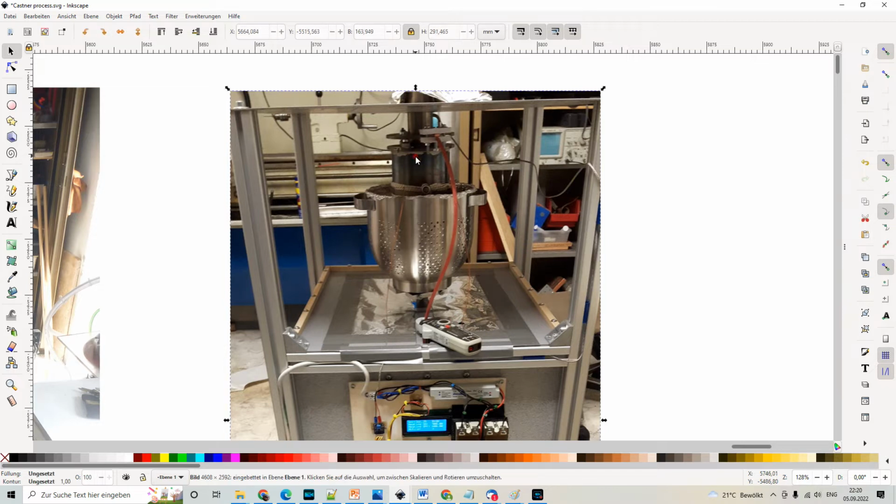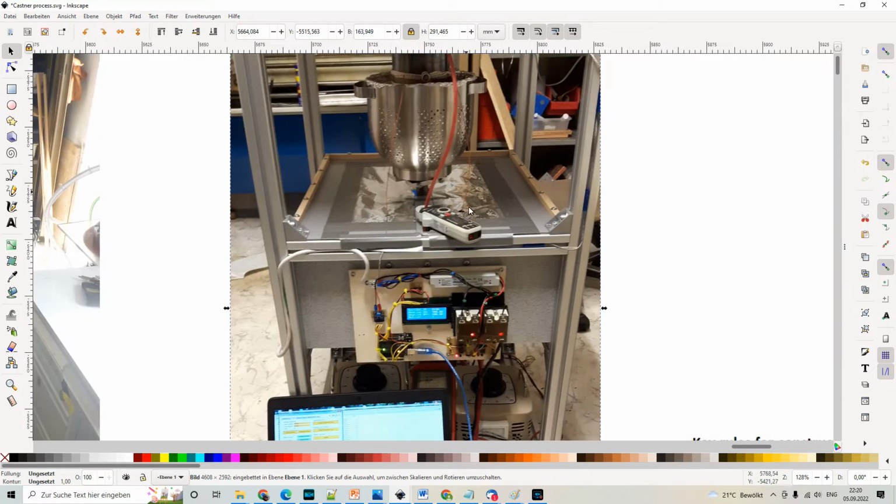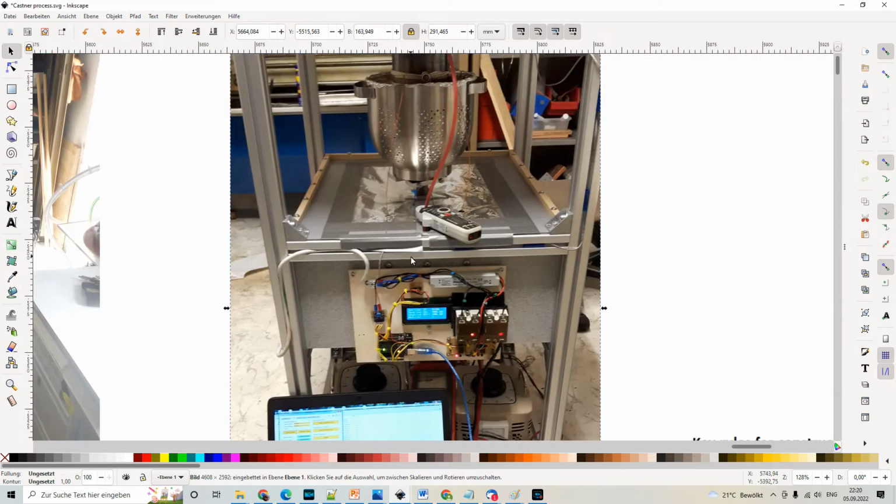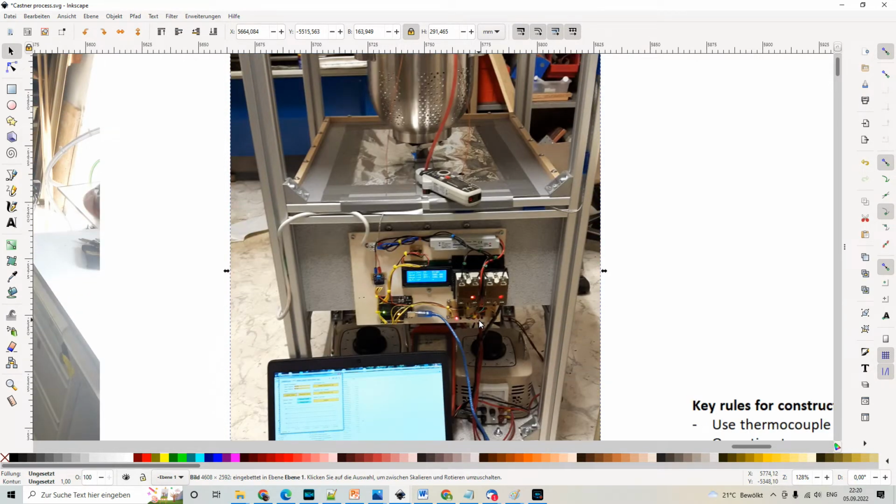Basically, you see the cell in here. This pot was just an insulator, filled with sand. And in this part you see the temperature regulation, and this is the thermocouple that goes up there. I will discuss the temperature regulation in detail, because the temperature of the whole cell is a crucial thing to make everything work.